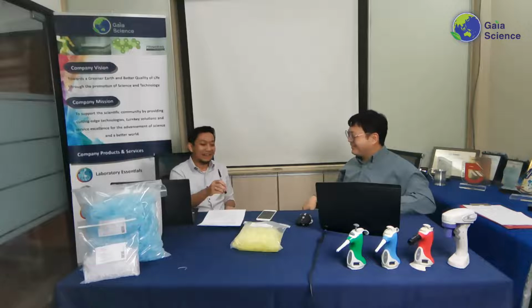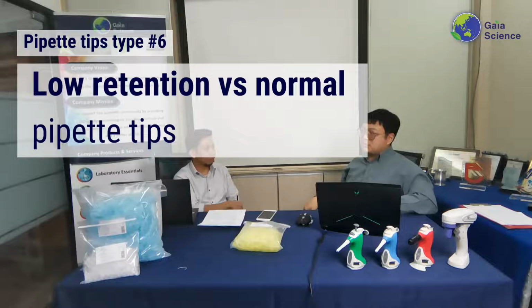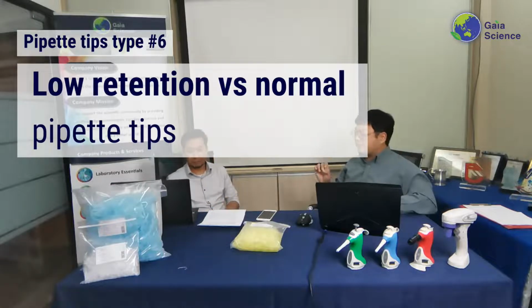Anyway, I think you mentioned a good point just now. Different pipette brands might use different materials in their production. If they use different materials, it will affect the quality. I guess the key thing when we talk about pipette tip quality is the retention. Yes, there are the normal sterile ones, and you also have non-sterile plus low retention. What are the differences? Good question. The low retention part is a very specific case.